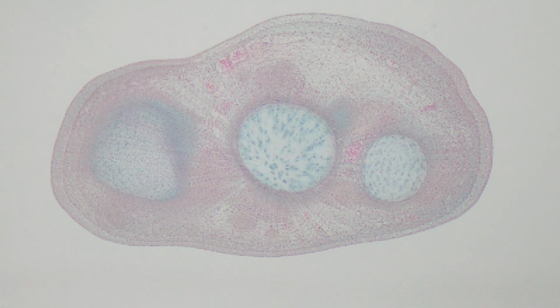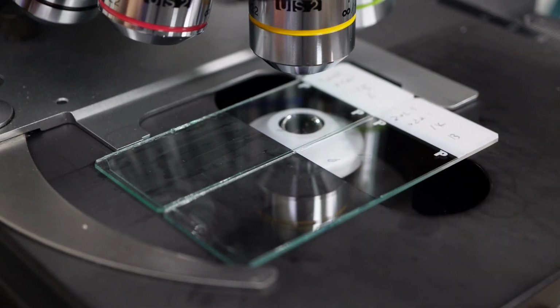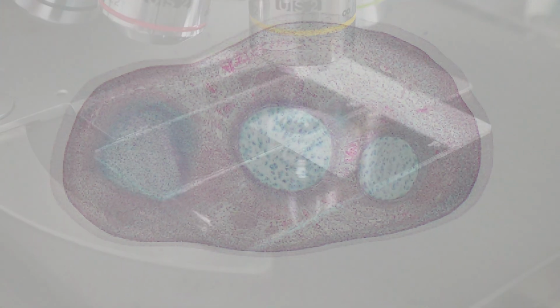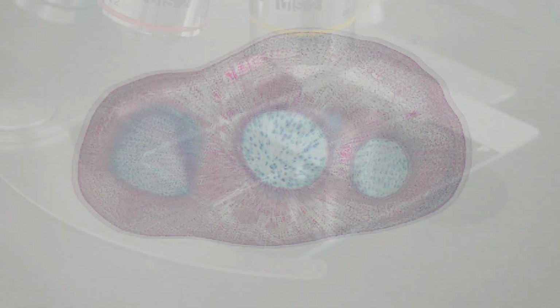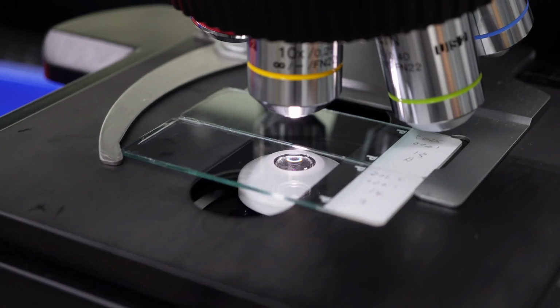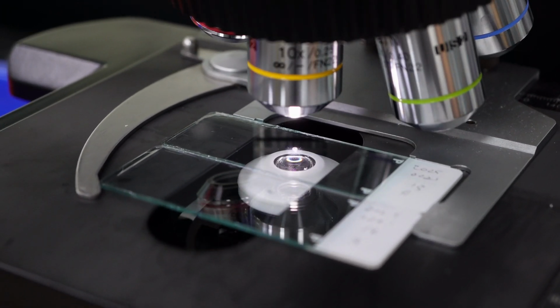Mentally stacking the slices. Exactly. You're mentally reconstructing the three-dimensional form. And the guide makes a really good point here. Remembering what the whole embryo looked like under the dissecting scope before sectioning gives you vital context. Having that initial mental map helps you place the 2D details. It really does. You're not starting completely blind. You have a framework for understanding the slices.